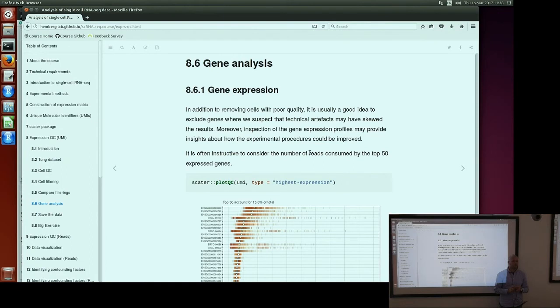That's the same as a matrix or data frame, more or less. So you can manually subset your cells from the scater object, or you can create a filter, either logical or not logical, but then when you use the filter, you have to say either you look for true or false values, or you look for 0, 1 values, whatever you defined before.